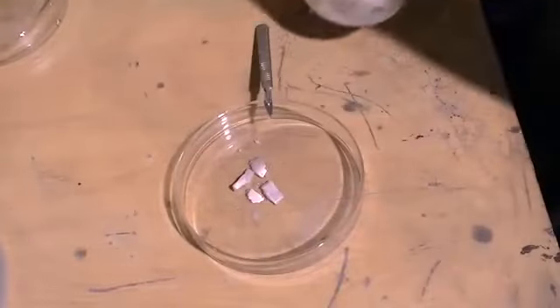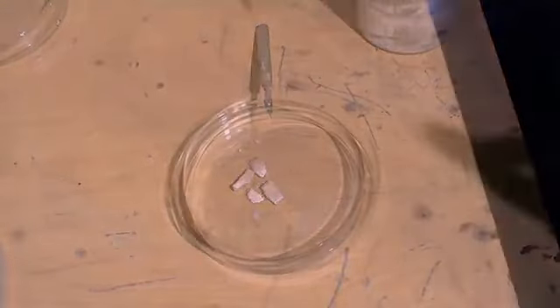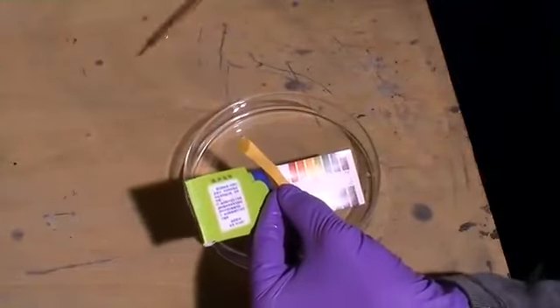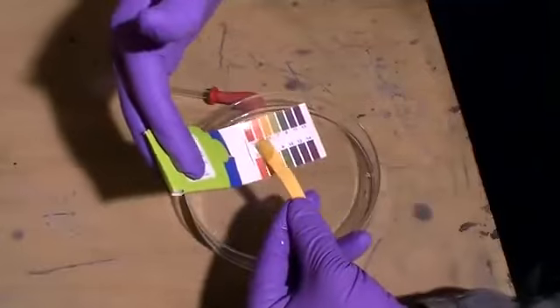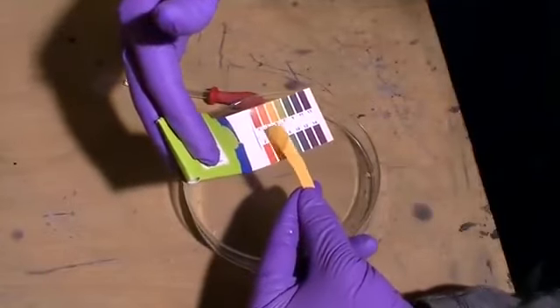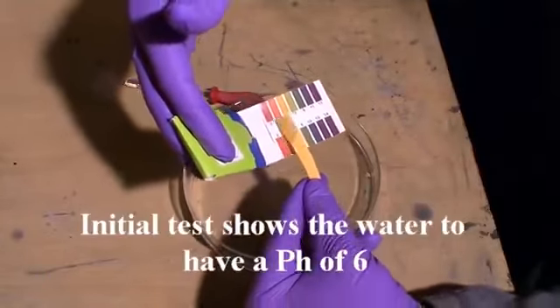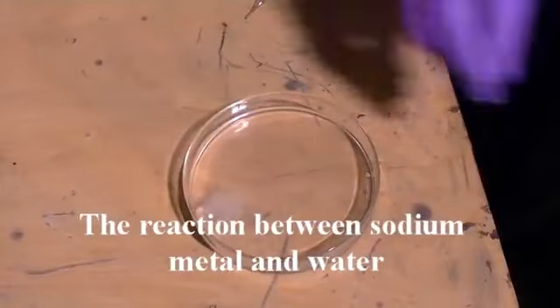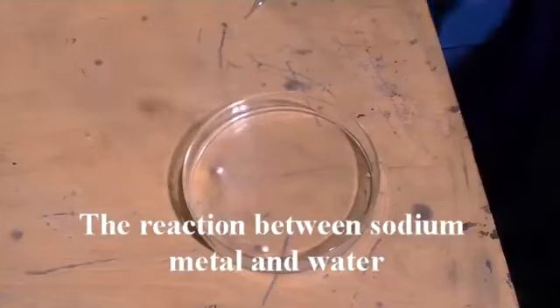The first chemical reaction we're going to look at is sodium metal reacting with water. We measured the initial pH of the water and found it to be around 6. Now we drop in some sodium metal and immediately you can see a reaction.